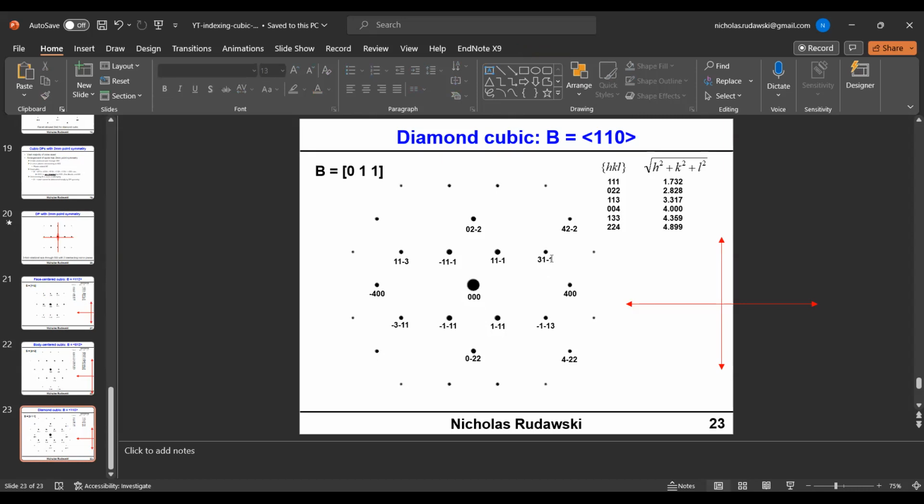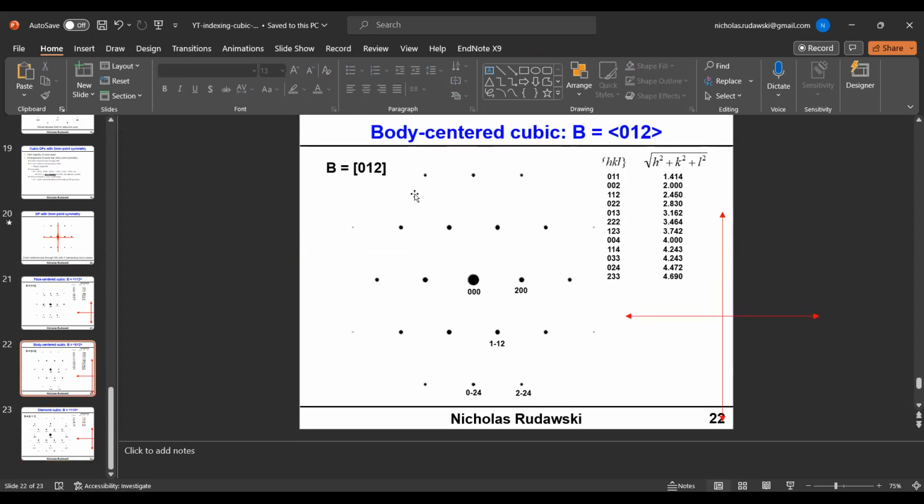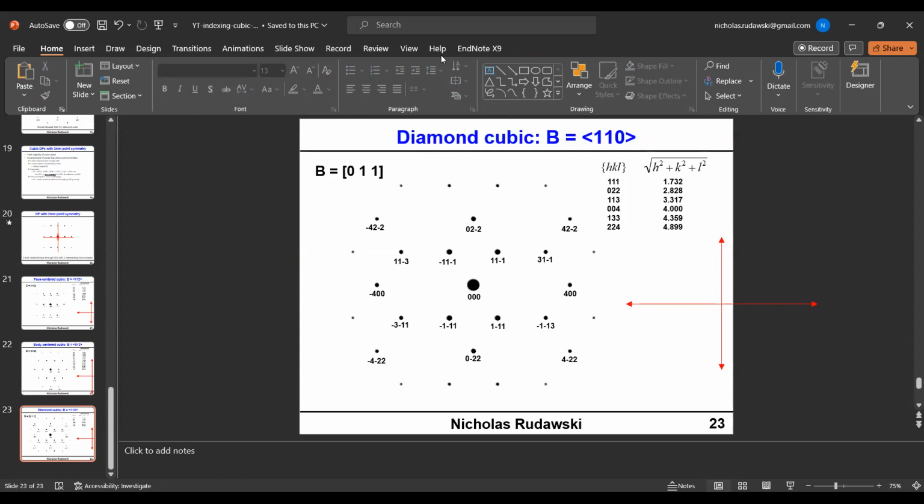All right, let me do these other ones out here, just for the sake of cleanliness, since we're finishing this up, just to make everything look nice. Okay, and then one more out here. And there we go, okay? So you can verify, right? I get a 0 dot product with all of these indices with B. Sorry, let me get out of this, okay? So that holds.